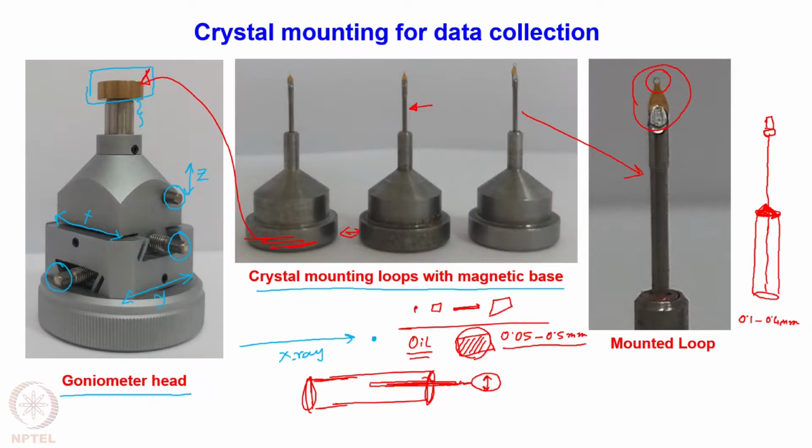The other option is that if you have a sensitive crystal which is maybe moisture sensitive or air sensitive, then one can use the Lindemann glass capillaries which we used in case of liquid samples. So what we can do is take a piece of a Lindemann glass capillary of a desired diameter and then insert this capillary in the same brass pin, a cylinder like this, and close it with glue. The bottom is also closed with glue, and then we insert the crystal from the top.